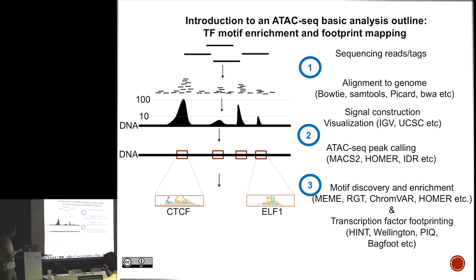So I focused on looking at the read information that supports the peaks, right, signal propagation. I've looked at peaks, right, individual units. But again, we're looking specifically at DNA. So within these peaks, there's some information that's also very useful. We know from the example that I showed at the beginning that proteins or transcription factors tend to bind to these locations, which renders them accessible. And actually, with motif enrichment or motif discovery analyses, you can look at the significance of enrichment of motifs that may be present in these open chromatin regions, right?